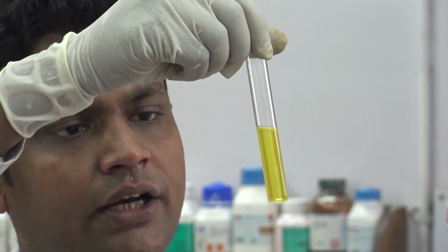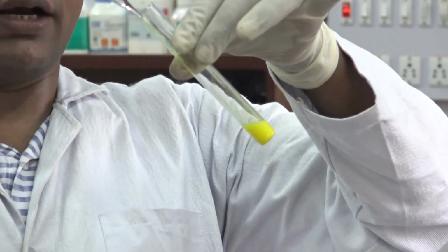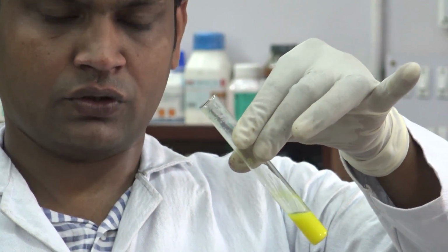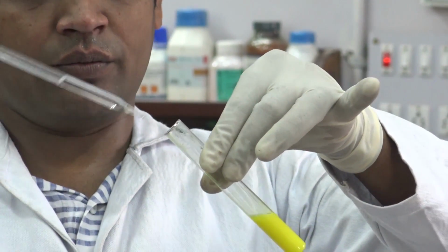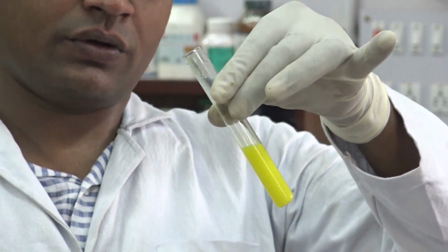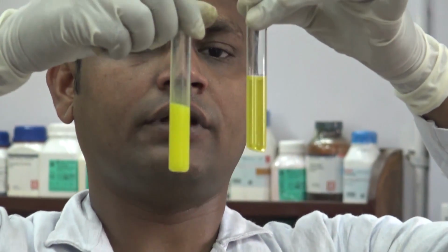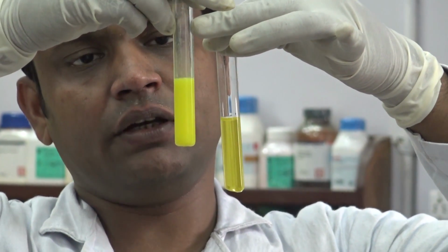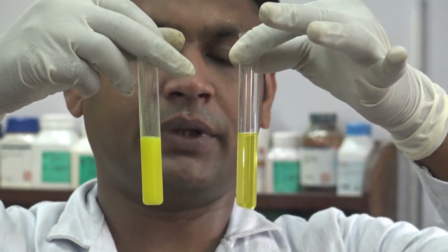In dilute nitric acid, the precipitate is soluble. In the other part, we will add dilute acetic acid, which cannot dissolve the precipitate. Here we can see that the precipitate is soluble in dilute nitric acid, but it is insoluble in dilute acetic acid. It confirms the presence of lead ion in our sample.